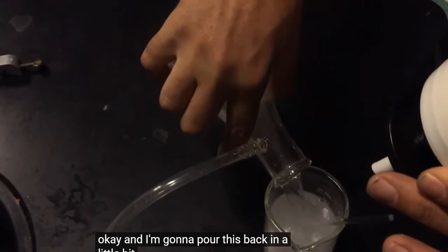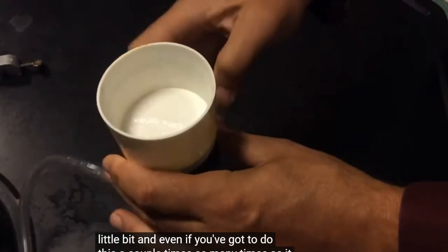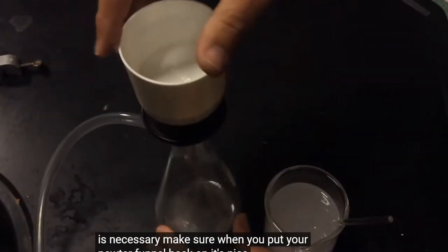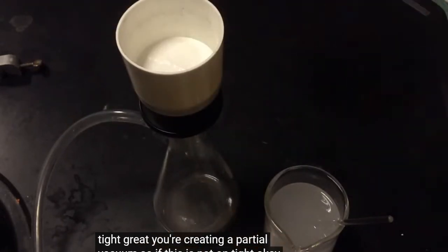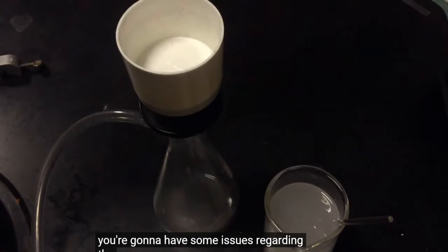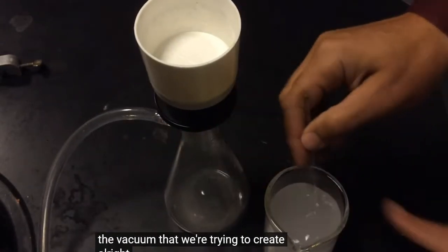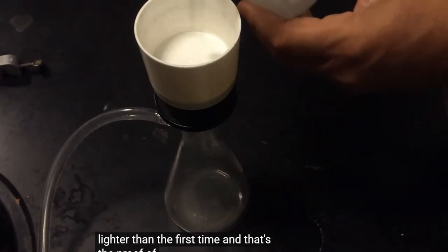And again, you've got to do this a couple of times, as many times as is necessary. Make sure when you put your funnel back on, it's nice and tight. You're creating a partial vacuum, so if this is not on tight, you're going to have some issues regarding the vacuum you're trying to create. All right, so as you can see, this is a lot lighter than the first time, and that's the purpose here.